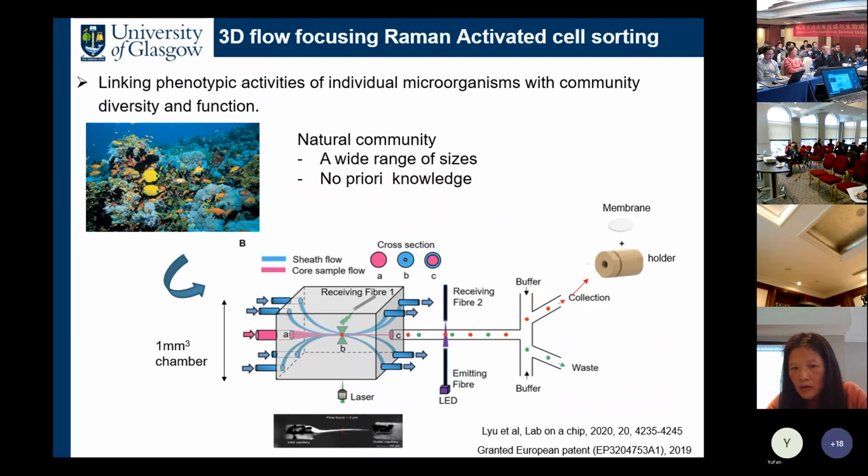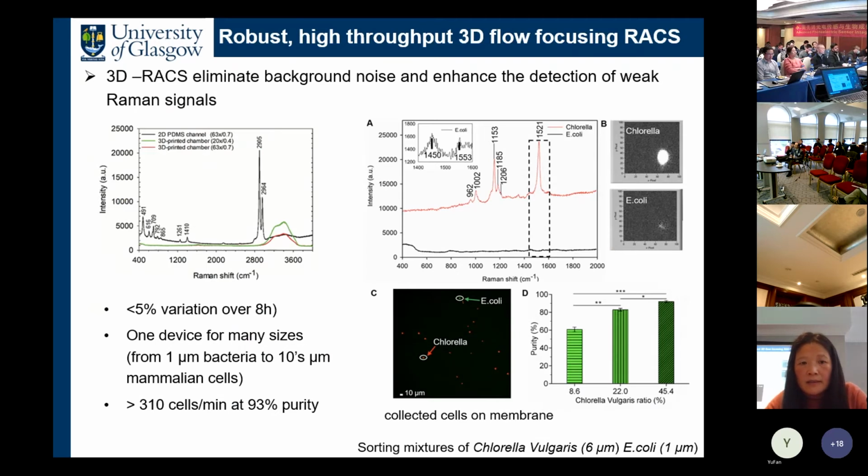Consider the chamber is 1 millimeter in diameter. Of course, we also integrate this optical fiber online that will improve both the throughput as well as the accuracy. Now, the additional advantage with this large detection chamber is that we remove any interference signal from the device.